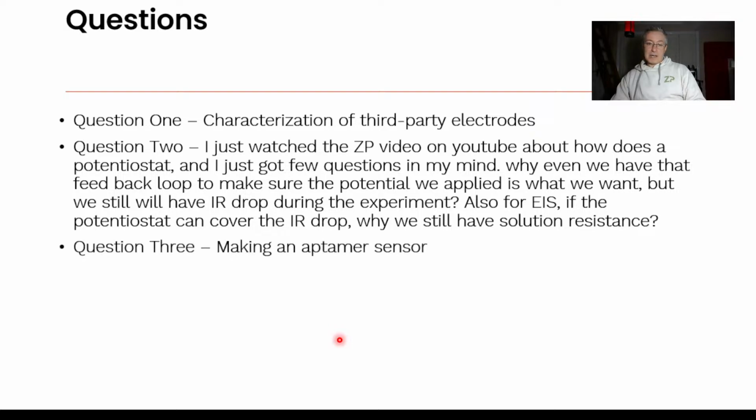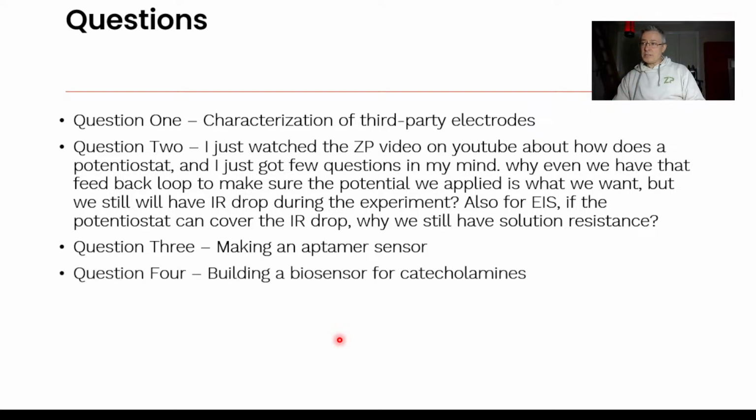But making an aptamer sensor, I generally think this person is binding their aptamer to their surface. Your work reflects our work. Our work reflects your work, but you're not getting a signal on binding. I suspect it's the aptamer itself. Building a biosensor for catecholamines.